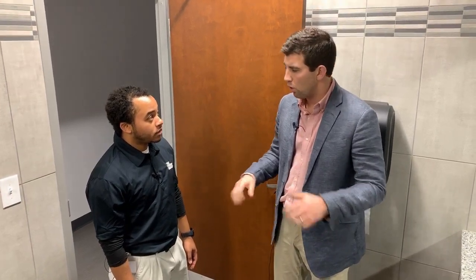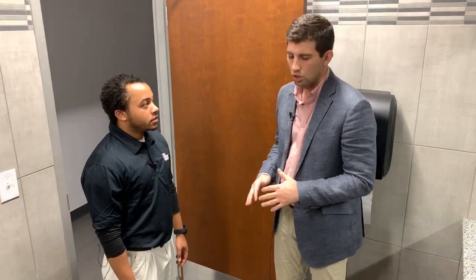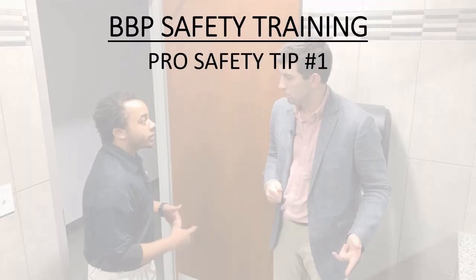Yes, possibly. Okay, so if I'm doing my normal routine and I'm going to clean the bathroom, does that mean I have to treat all of those things like blood? Negative. You don't always have to treat it all like blood, only if you see blood within them. Okay, so it could be in those things, but only if they have blood in them. Exactly. Gotcha. So what do we need to do to clean this up then? Well, let me go grab my bloodborne pathogen kit, and then I'll show you how we do it.